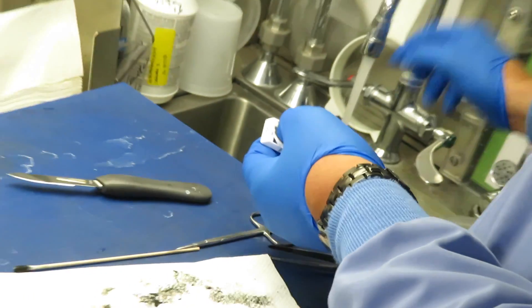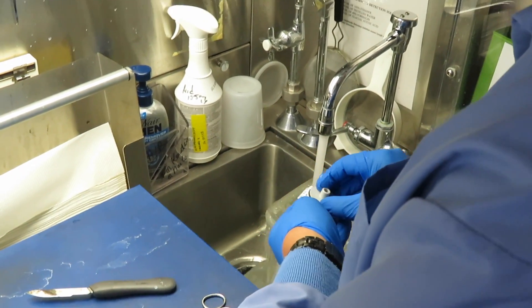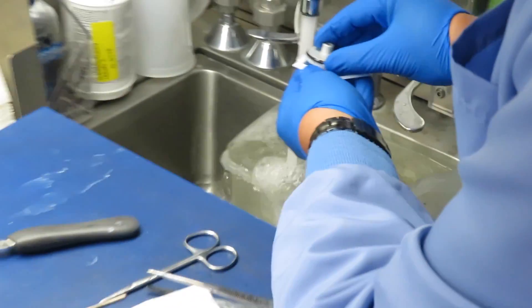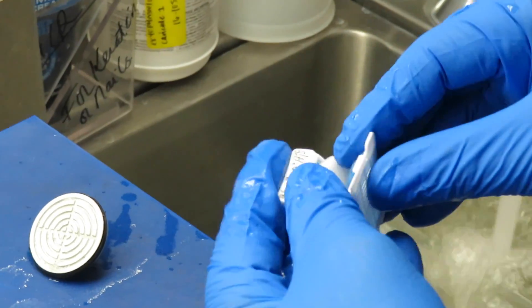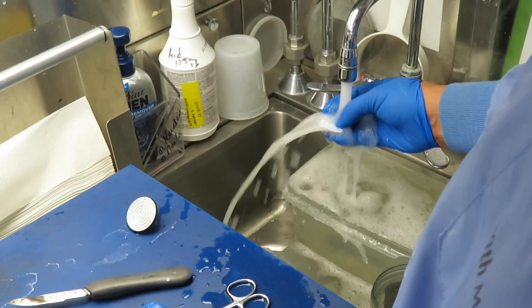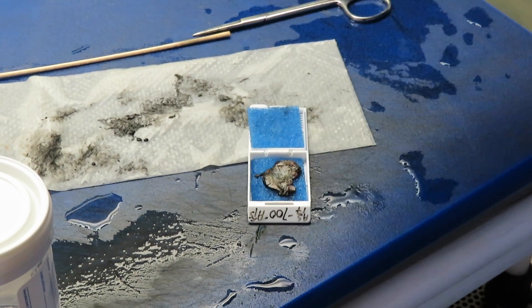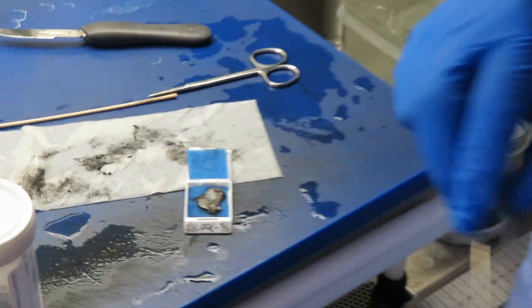Now he's warming up the tissue inside the frozen OCT compound on the chuck platform. One way to get the OCT off is warm water — warm water is faster. Once it washes off, the tissue remains inside the cassette. The sponges maintain the orientation of the specimen so that when embedding happens tomorrow, she'll embed it to show the same surface we got at the frozen section.